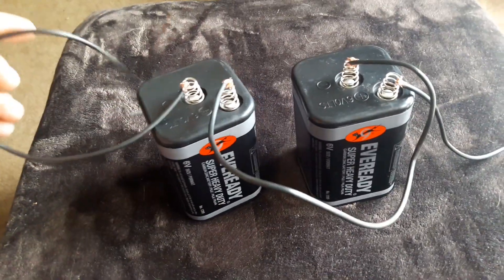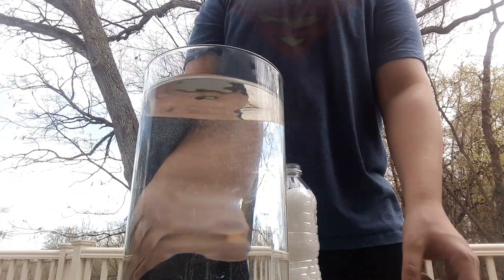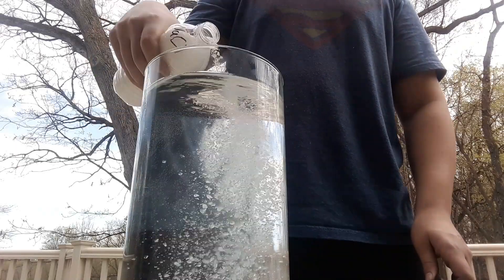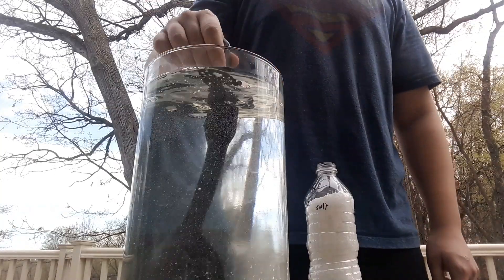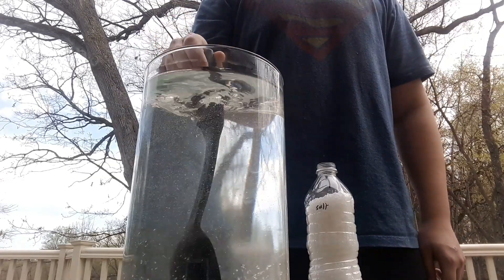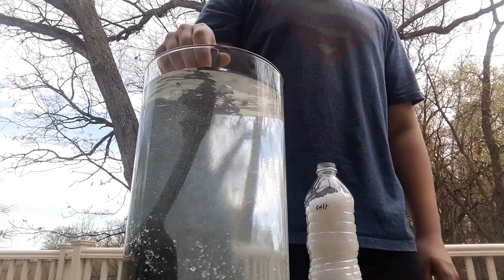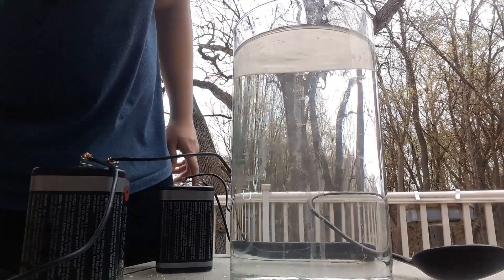Now we're going to fill up our container with water and we're going to add some salt to it, and do this until the salt is dissolved.